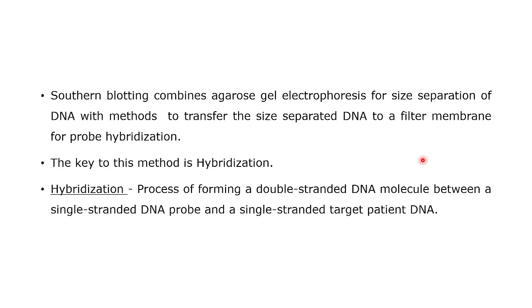So the probe would be designed in such a manner. This probe can be fluorescent labeled, or it may not be fluorescent labeled. That is not our concern. What is our concern is that the sequence, the genome sequence, is known to us. It can be the genome sequence, it can be a small DNA sequence, but that should be known to us, and the probe should have a sequence that is exactly complementary to that particular DNA sequence.